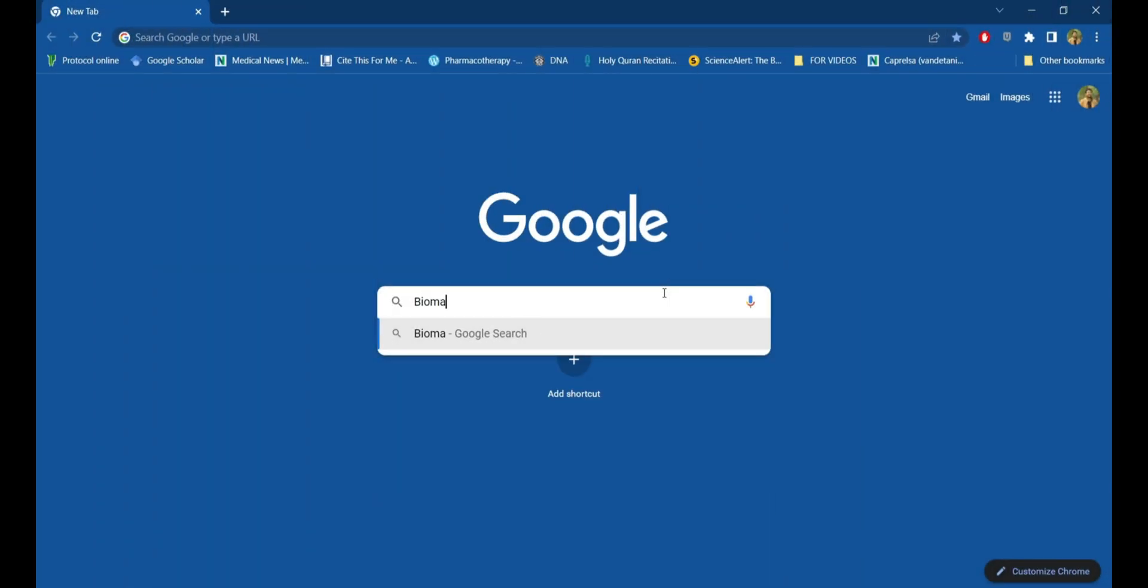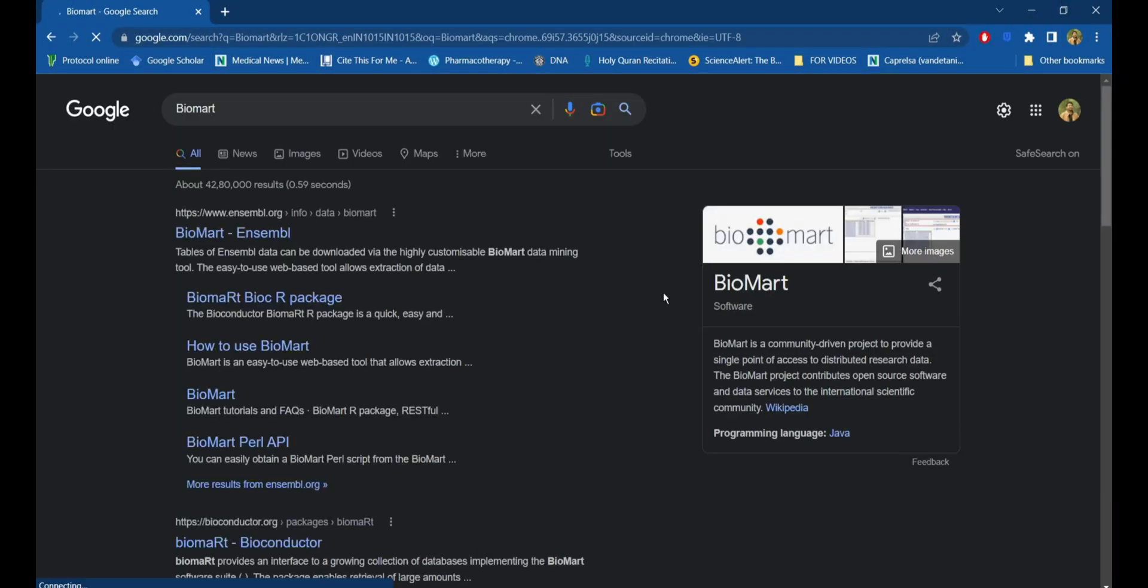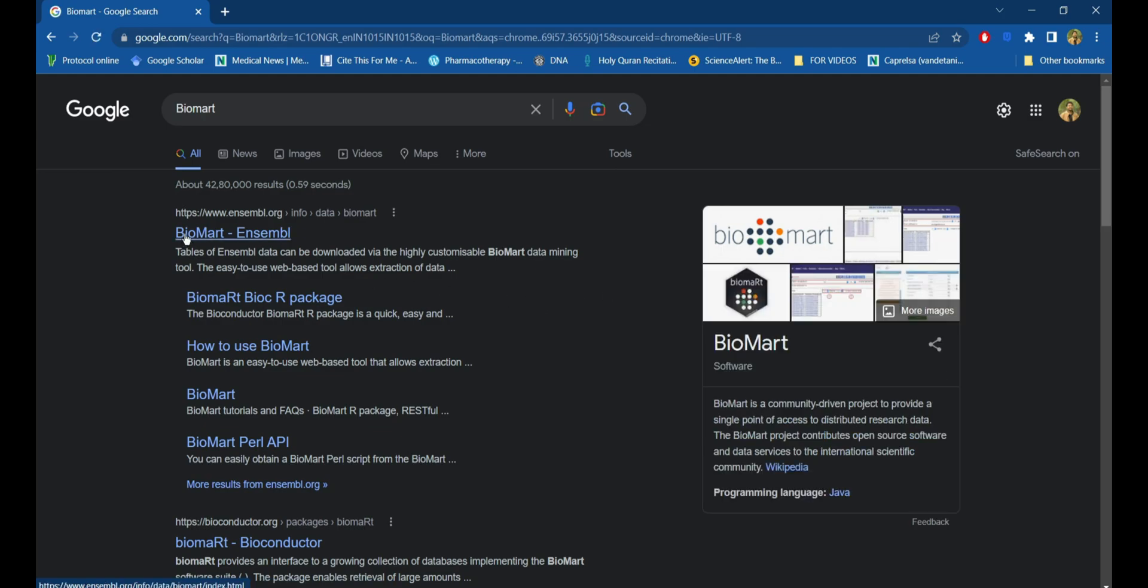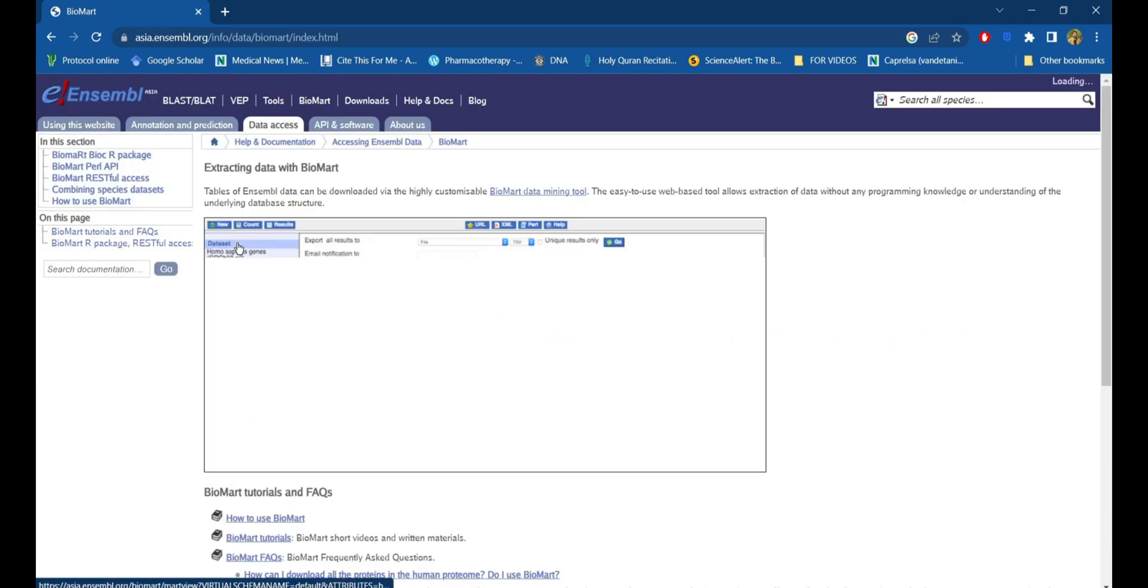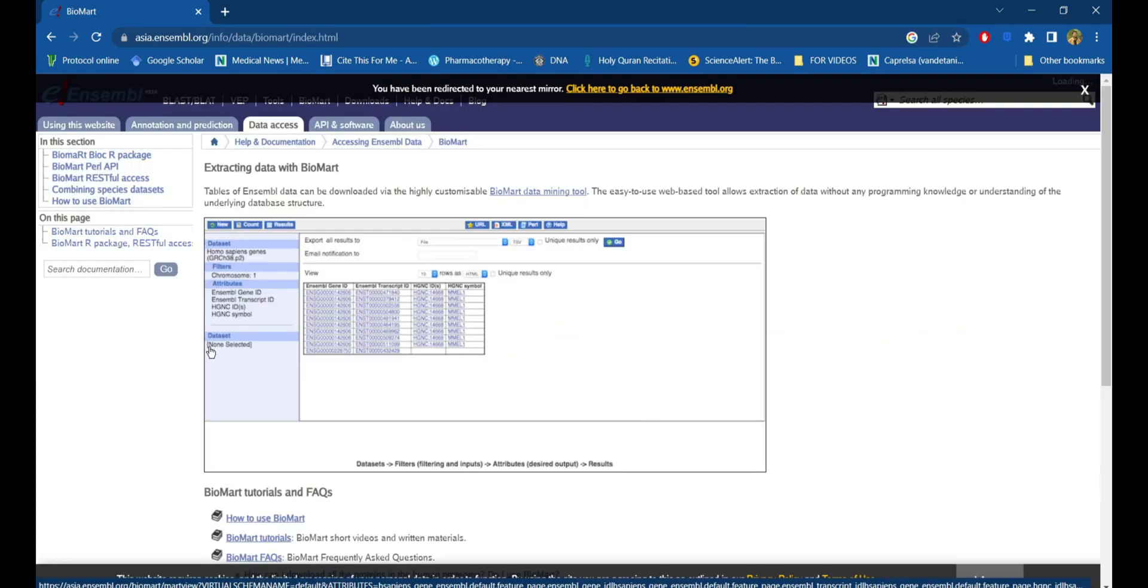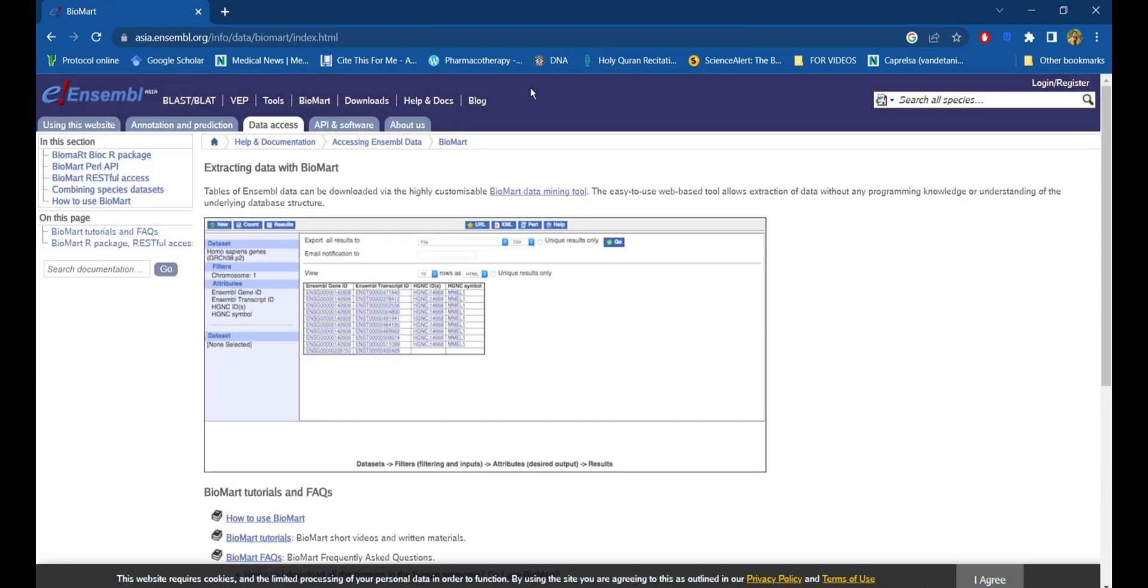To begin with, search BioMart in Google. BioMart is an open software and data service developed by an international scientific community. Click on the first result, BioMart Ensembl, then click on BioMart which will redirect to its server.